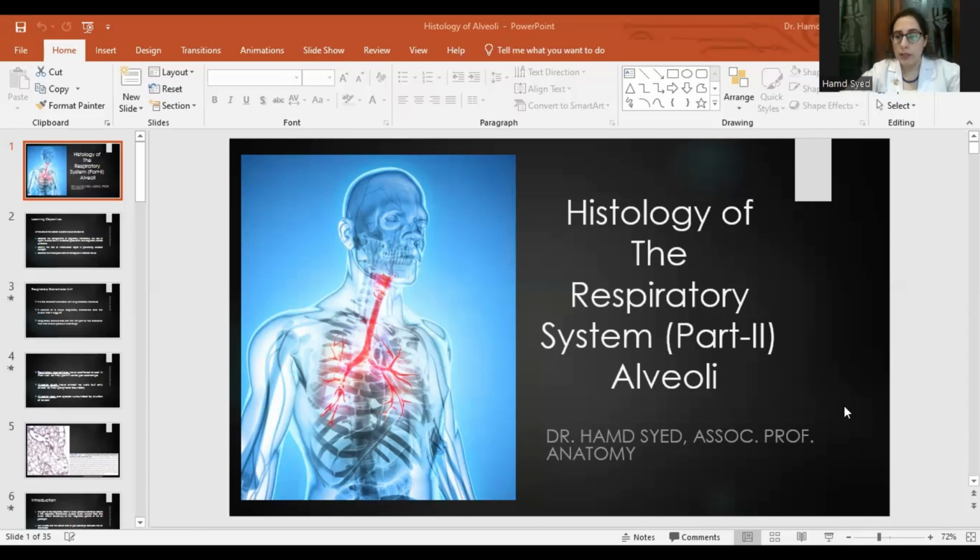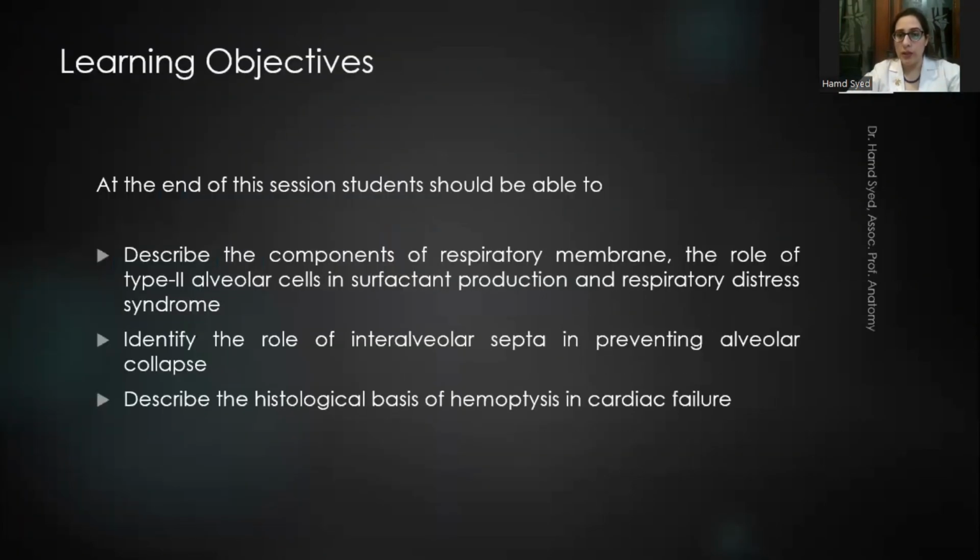Today we're going to be discussing part 2 of the topic, which is the histology of the respiratory system. And in today's discussion, we are focusing on the histology of the alveoli.